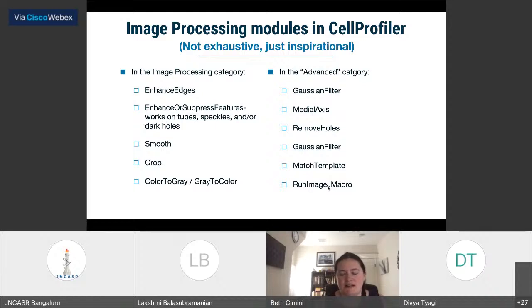We're really excited to have this functionality back in CellProfiler, and it can be really quite helpful if there's a particular filter or transform that you just need to access without needing to write a whole CellProfiler module just to do it.